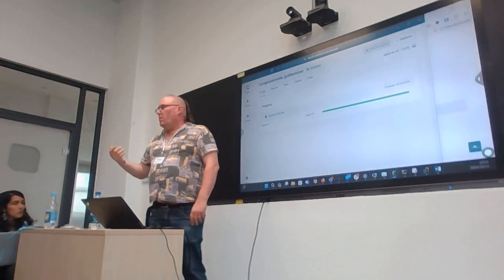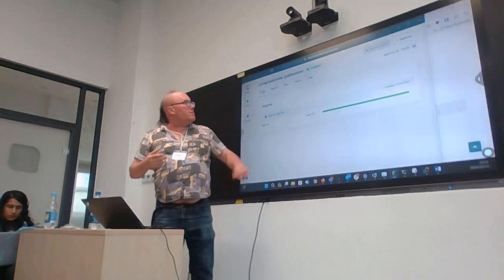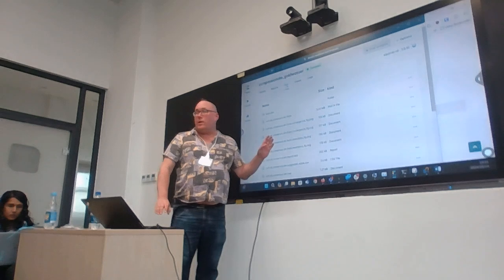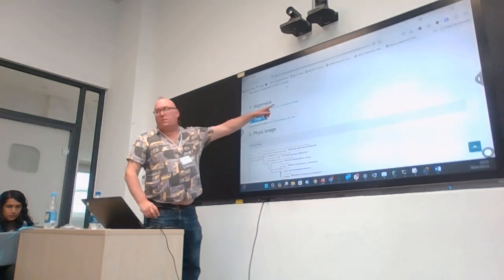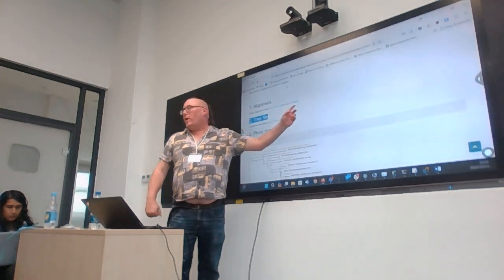It ran and it produced some outputs, the different output files. I'm not going to go into the detail of the files right now. One of the output files is this HTML web report.